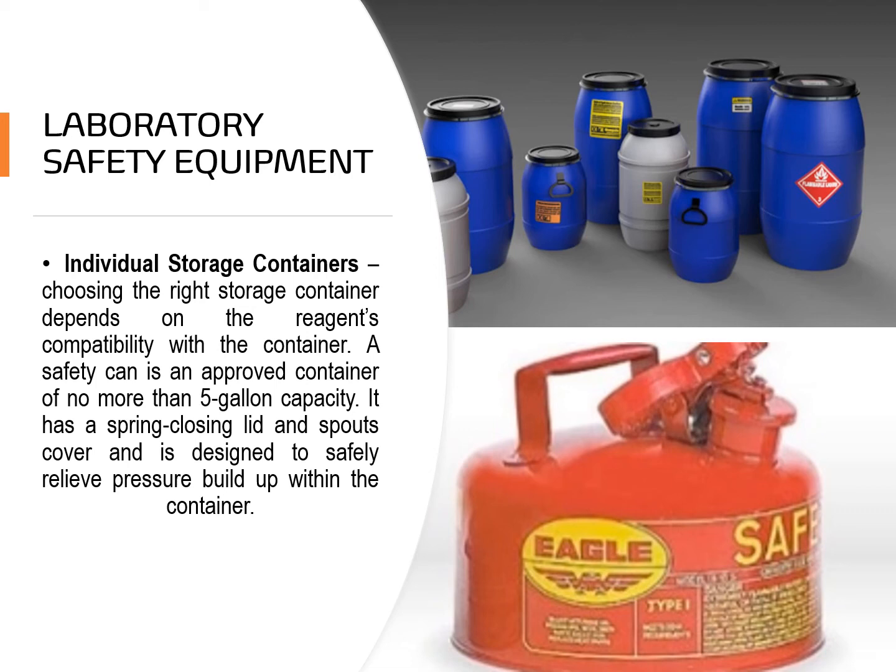We start off with our individual storage containers. Choosing the right storage container depends on the reagent's compatibility with the container. A safety can is an approved container of no more than 5-gallon capacity. It has a spring closing lid and spout cover and is designed to safely relieve pressure buildup within the container.